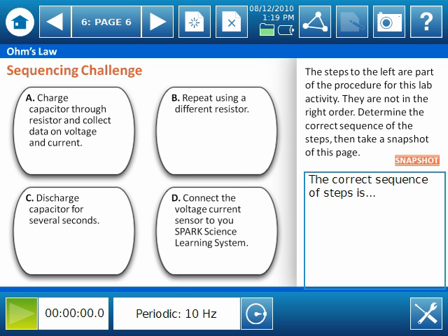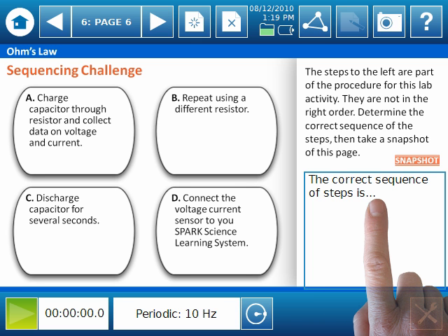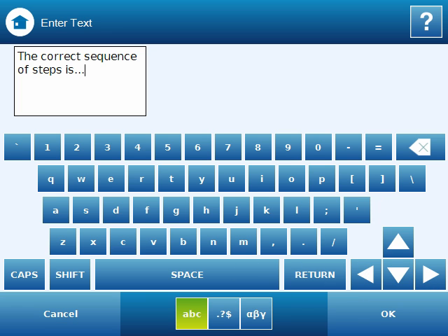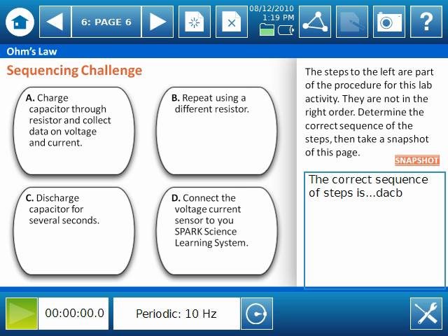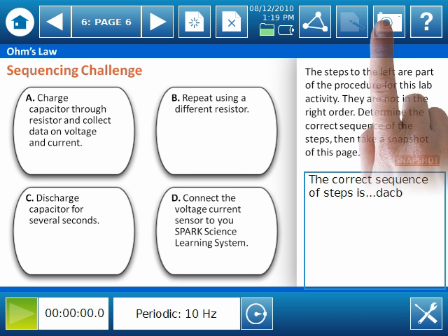Part of the guided inquiry in each of the Spark Labs is the sequencing challenge. The sequencing challenge is designed to get students thinking about what they're doing before they actually start the lab activity. To enter the sequence, students simply select the blue text entry box and enter their answer. As you can see, the answer is now in the text box. And as the snapshot icon reminds us, we'll select the snapshot button to add this page to the journal.